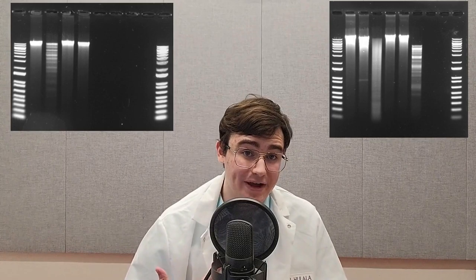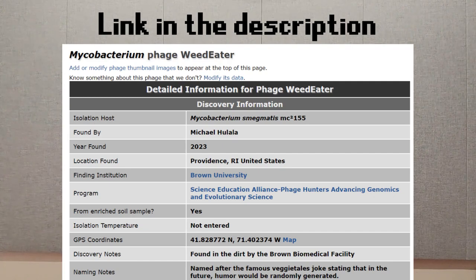We also had something called a ladder, which basically separates the different concentrations and it acts almost like a ruler to give us an understanding like, okay, well this one moved this far down, so it has to be almost like this one. We're going to do a few more gels because there's a lot of restriction enzymes out there, and this is kind of what they look like. They look way cooler than they actually are, trust me. And now that we know that how they respond to all these restriction enzymes, we can basically determine compared to other sequence genomes what they're going to look like. And we're done. That's it. That's the whole process. Boom, you found a phage. You figured out as much information as you can for it. It's ready to get sequenced.